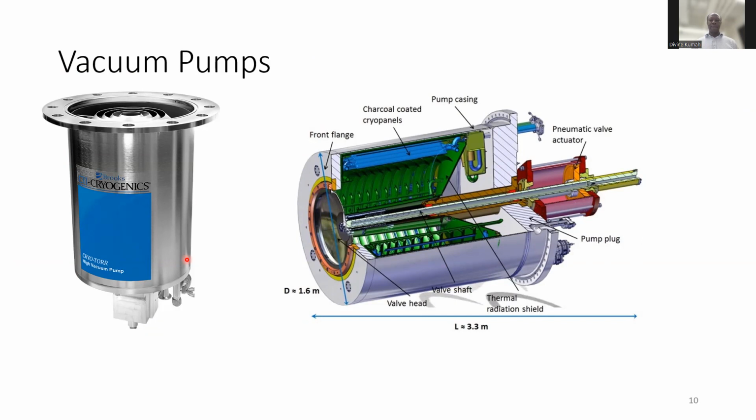So the vacuum pumps, as I mentioned, are required to obtain really high vacuums in these systems. There are different kinds of pumps which can be used depending on what kind of base pressure you would like to achieve. One common type of pump is called a cryo pump. The way a cryo pump simply works is that you have a cold finger, a finger which is cooled down using liquid helium to a few Kelvin. As you suck out all the gases from your chamber, they land on that cold finger and they get frozen into place, right?